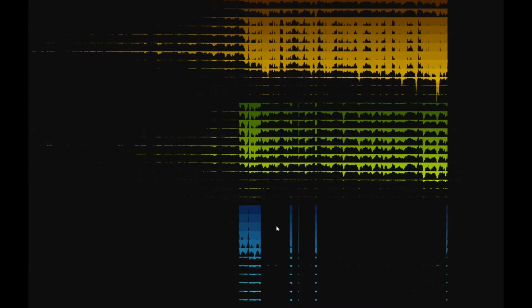Let's zoom out to a chromosome view and find another activated gene. Looks like this gene follows a different kinetics compared to the previous one. We can use the 3D view to confirm this. Indeed, the activity of this gene increases throughout the 2-hour period, reaching a maximum at the 120th minute.